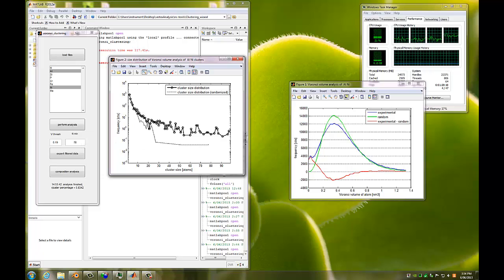So you can see here that there's a certain level of confidence in what is a random cluster and what is a significant cluster. And the largest cluster that we found in a random distribution is at 78, but that's really more of an if I have a cluster with 78, it's very likely to be non-random.